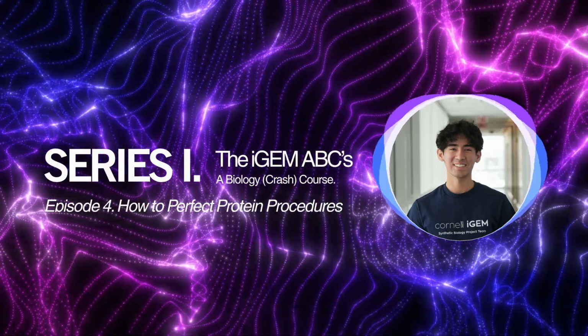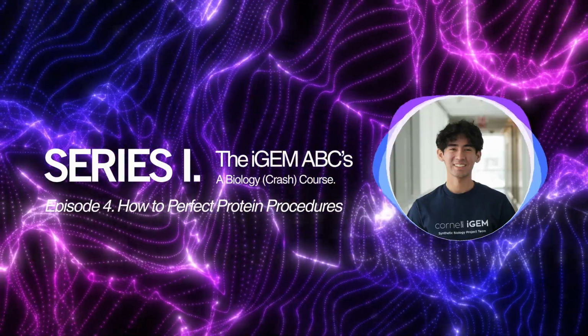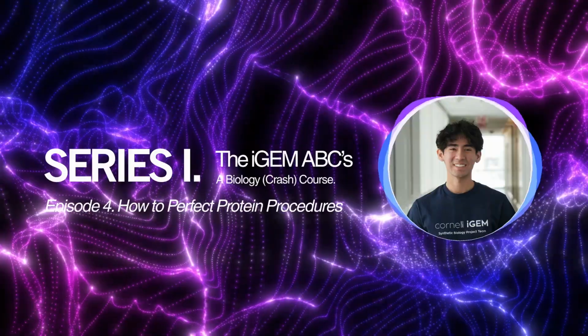Now, let's start after we've transformed our bacteria with our plasmid. The next step is to culture the bacteria, usually in high volume so that we can get a lot of protein out and have a lot available for downstream experiments. Here's Ellie Campbell to tell us more about culturing your bacteria.